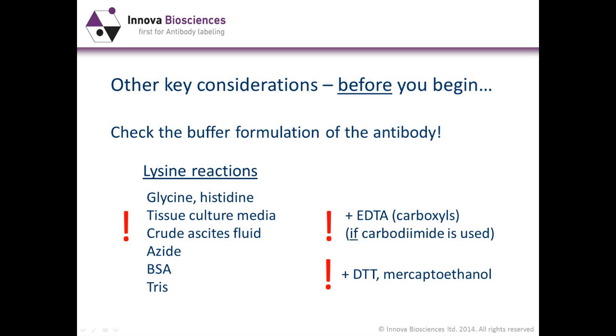Now, you may still be able to conjugate your antibody without having to dialyze it to clean it up, but it depends on the concentrations. You just need to be cautious. Watch out for these things, and if you pay attention at this point just to what the data sheet says, you can ensure you get a good result when you carry out your conjugation reaction.